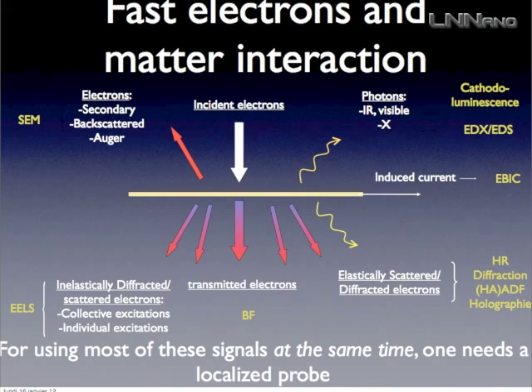When you have sent this electron, it can have been diffracted, but it can also have given some energy to the medium, to the sample. And so the electron will lose some energy. If you are able to measure how much energy an electron has lost, you can make an electron energy loss spectrum, or electron energy loss spectroscopy, with these inelastically scattered electrons.